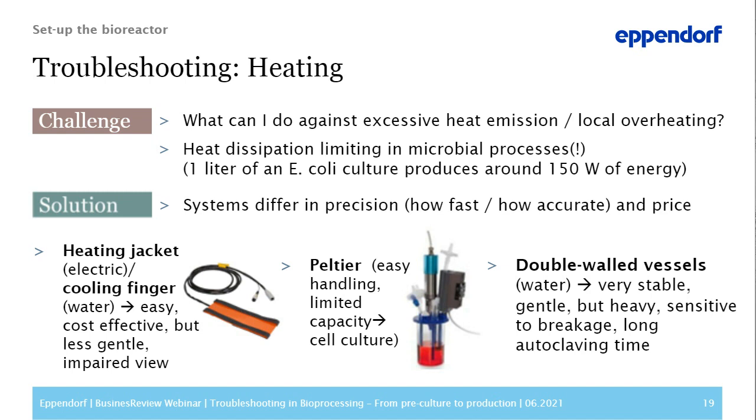Then the heat transfer methods can be applied accordingly. Now, heat transfer can either be done externally or internally. So for large-scale reactors, certain internal methods should be used because only these internal methods can soak up heat in such large quantities compared to external methods.